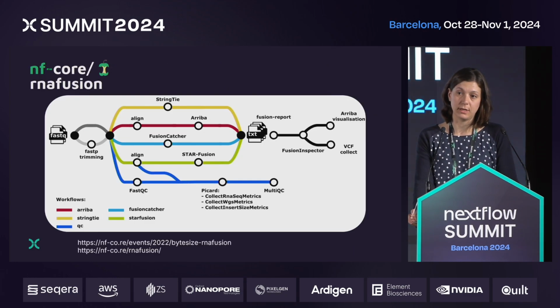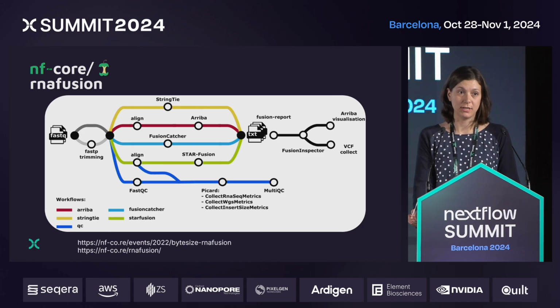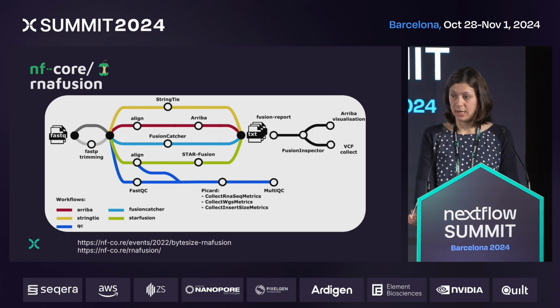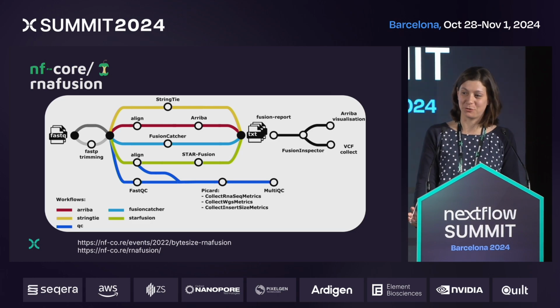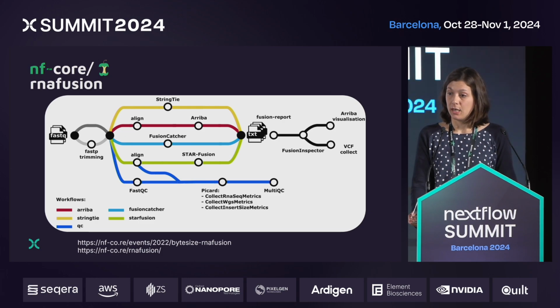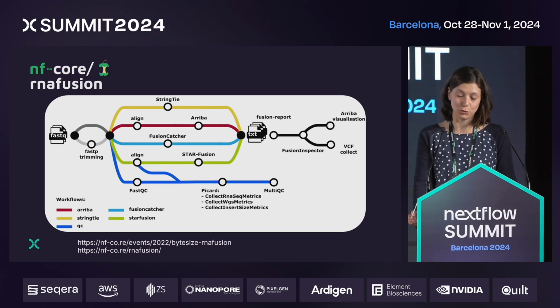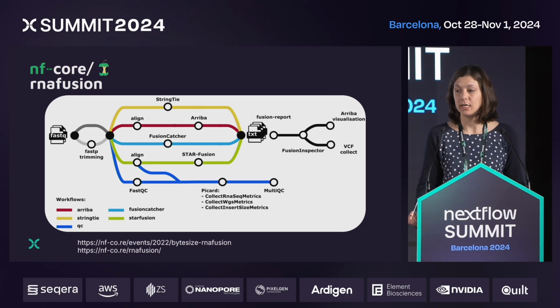The part with whole transcriptome will be done with rnafusion, and this is a pipeline that I'm currently the main developer on. It is a very simple pipeline, a very simple metro map, and it has post-processing, very standard QC, and some visualization. I will not go any further into details. I will leave you with a bite-sized talk and the documentation as well as the Slack channel, but feel free to ask questions. And I will say that a release is soon to come with some major updates, I hope in the next few weeks.